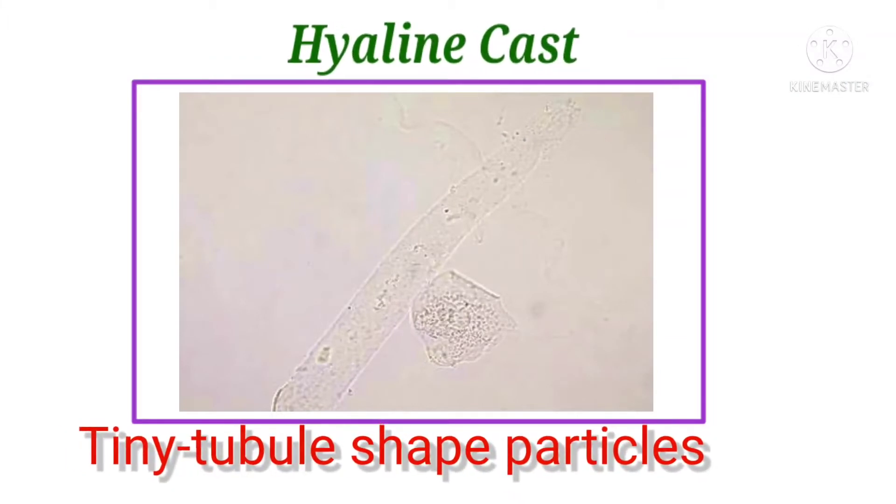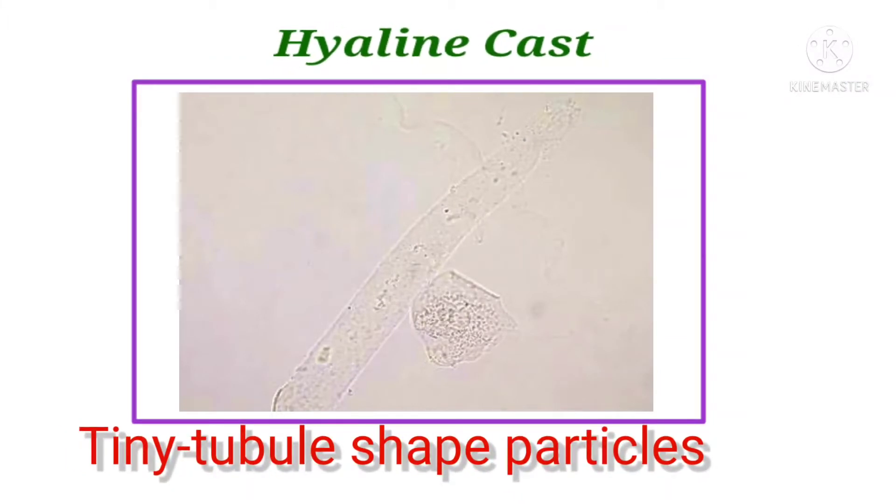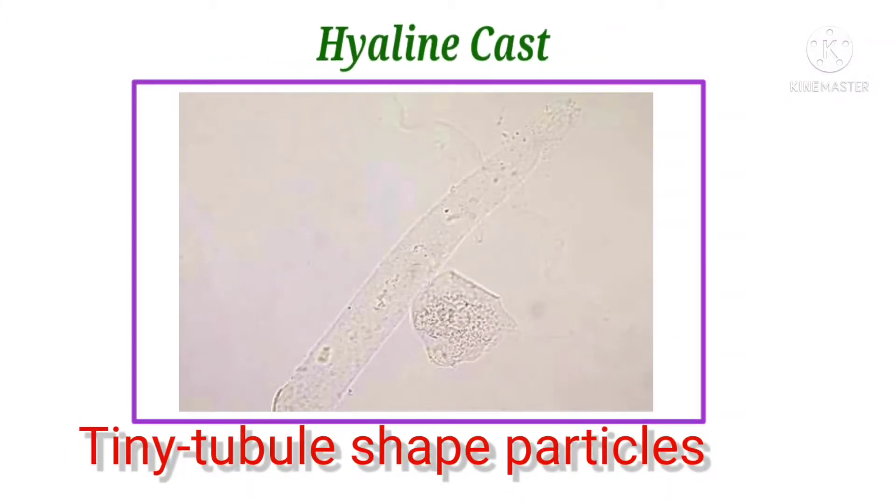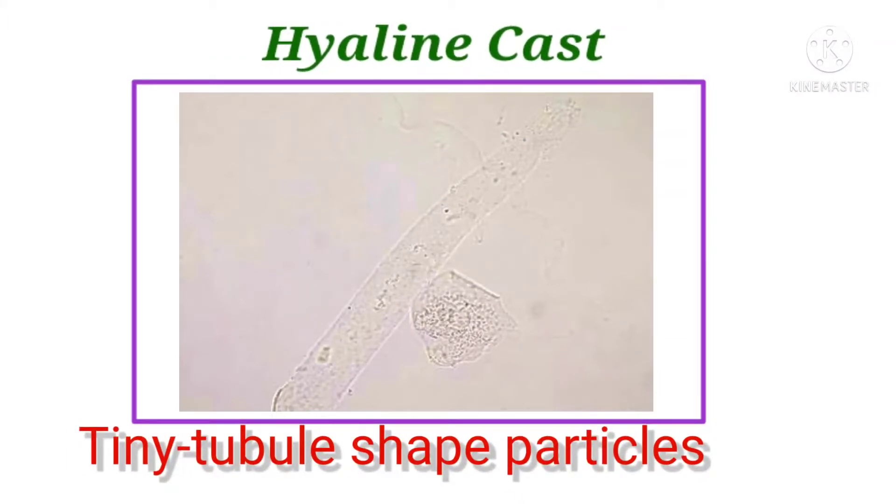Hyaline casts appear as clear, tiny tubule-shaped particles.